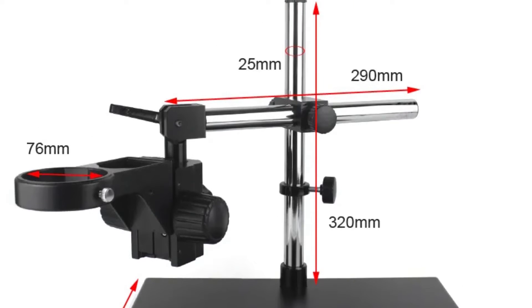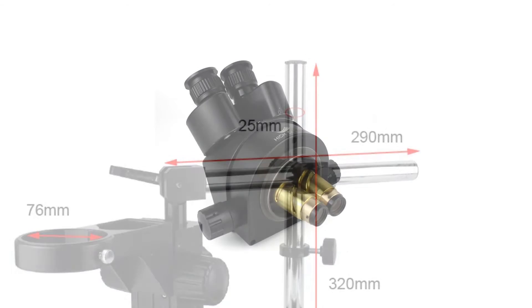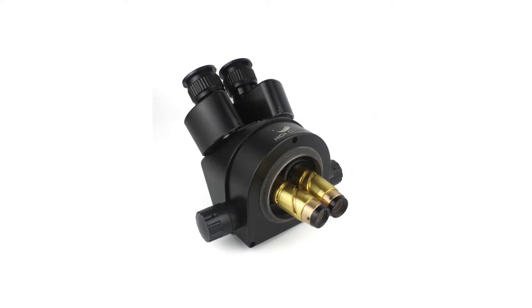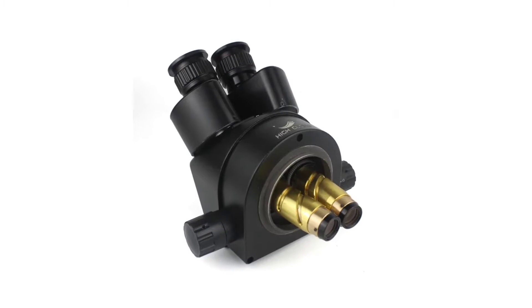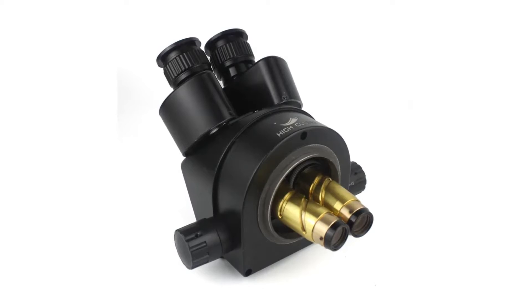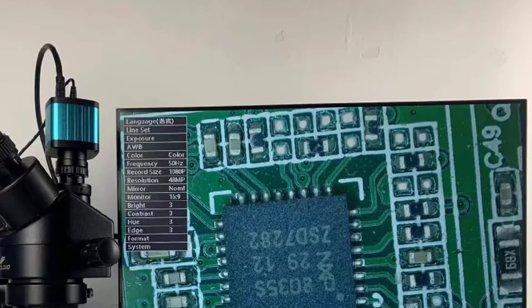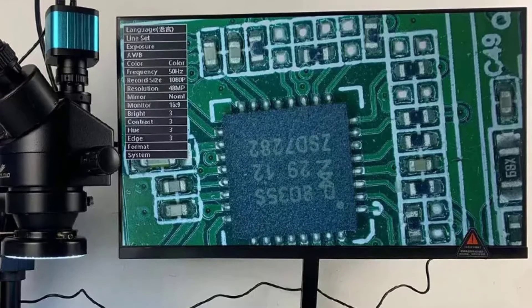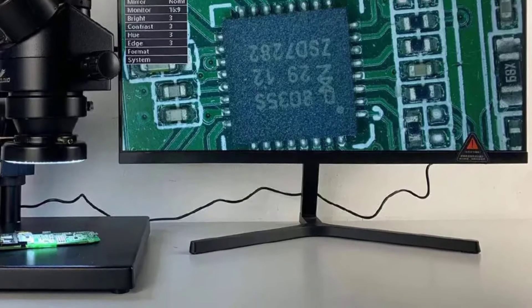The trinocular design is a fantastic feature that sets this microscope apart. It allowed me to use the microscope with both eyes, reducing eye strain during long observation periods. Additionally, the third port for a camera or digital device is a game-changer, making it incredibly easy to capture high-quality images and videos for documentation or sharing with colleagues or students. The smart device compatibility is a bonus for those who want to connect digital devices for live streaming or remote collaboration.